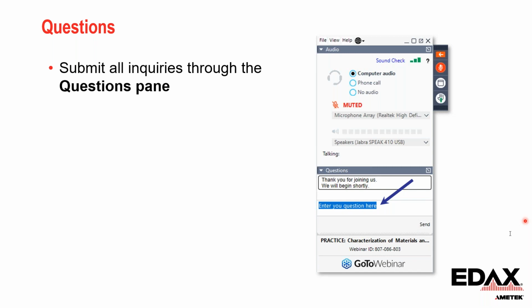This is a very good question. EDS can do peak deconvolution to resolve overlapping peaks. Why do we still need WDS? If you are mapping or quantifying elements with overlapping peaks, the results will not be accurate because of the addition of counts from the other elements.